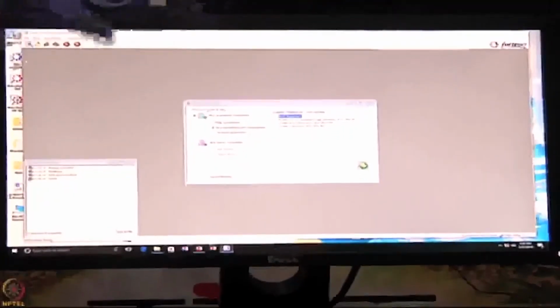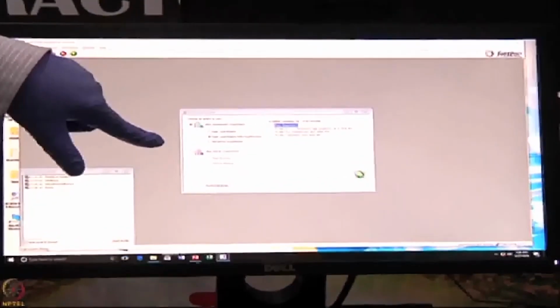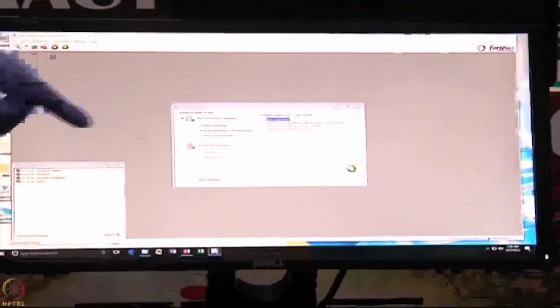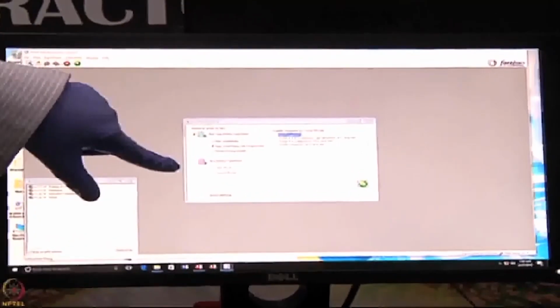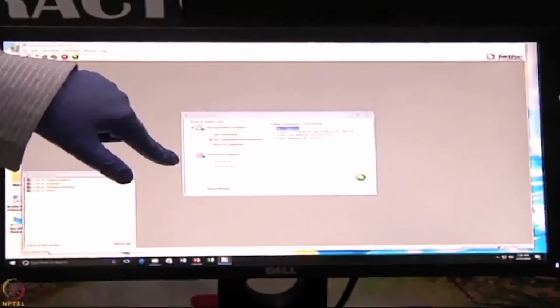When you click on the data acquisition software, you can see there is a wizard. In the wizard, you choose what kind of experiment you want to do, whether a kinetic study or a quantitation study. We have the options kinetics as well as quantitation. Our interest here is kinetics experiments.